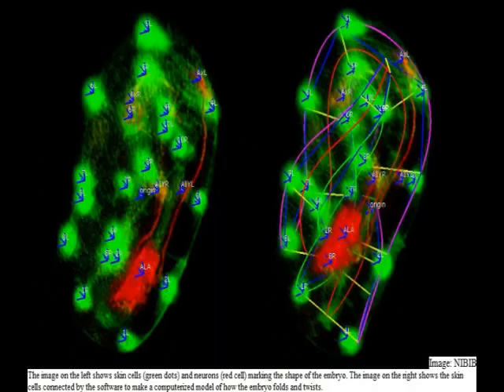Understanding why and how neurons form and the path they take to reach their final destination could one day give us valuable information about how proteins and other molecular factors interact during neuronal development, explained Harry Shaffer, head of the National Institute of Biomedical Imaging and Bioengineering NIBIB research team. The new technology will be pivotal in their project to create a 4D neurodevelopmental worm atlas that attempts to catalog the formation of the worm nervous system.